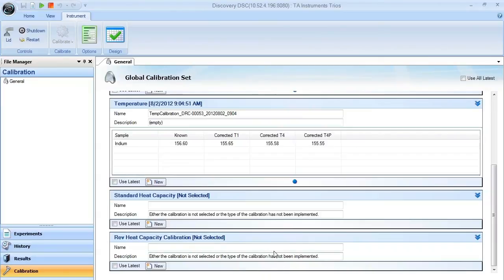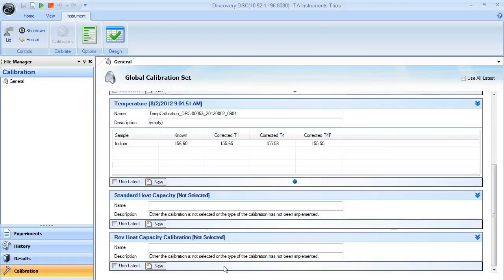Once in this window, we can then verify the calibration is correct and we're ready to run modulated experiments to collect heat capacity on our samples.